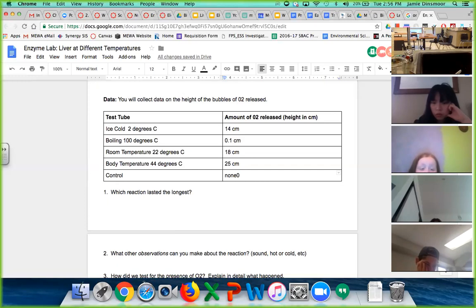25 milliliters was actually way too much because I completely overdid the tube, so we're going to make it less. Good thing I have more liver. Backup liver. I did not think about the tube actually being a certain size, right? Just plop that liver out. Okay, good thing we're going to do that again. That was a really anticlimactic drum roll.